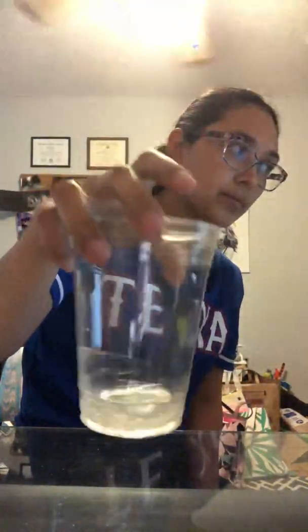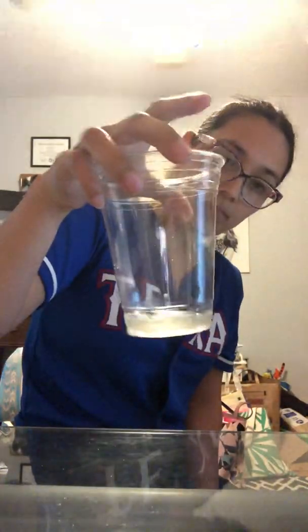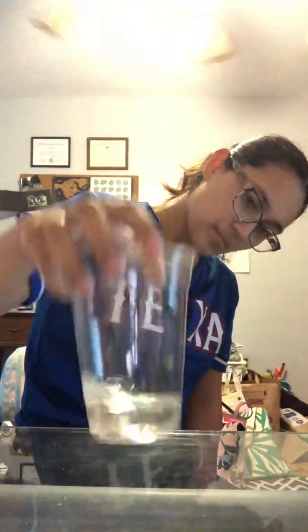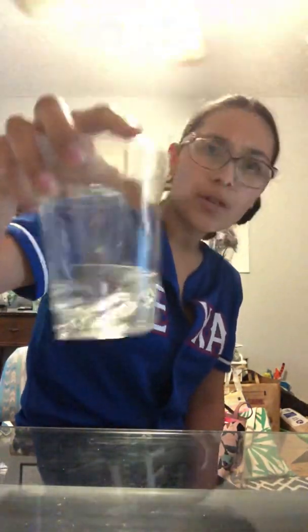It's not as cold as the other one yet, but it is getting pretty cold. It's got a yellow color to it.